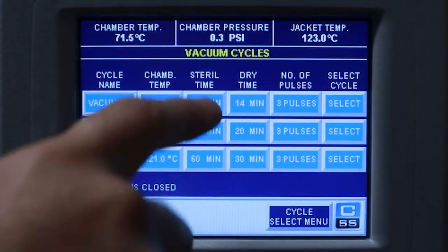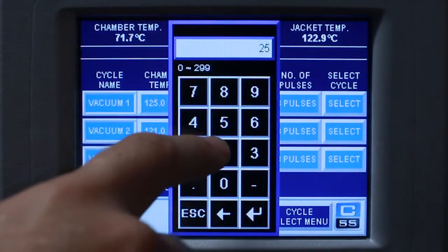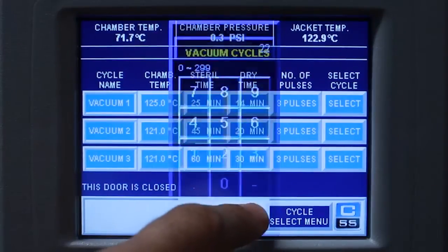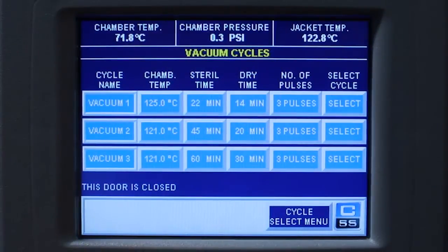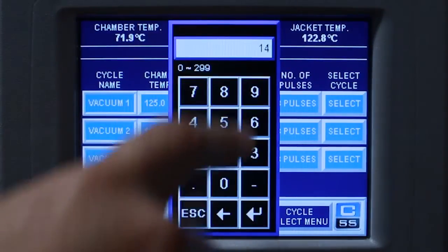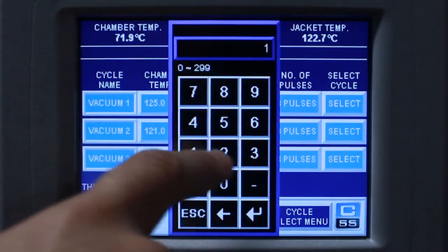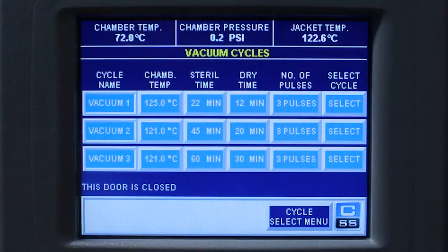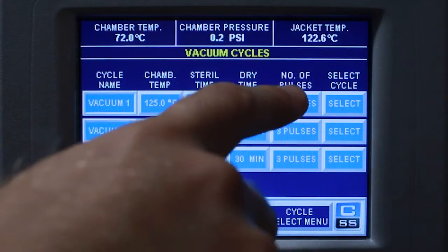Enter your sterilization time. Enter your dry time. Select the number of pulses.